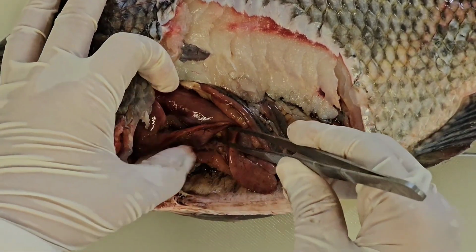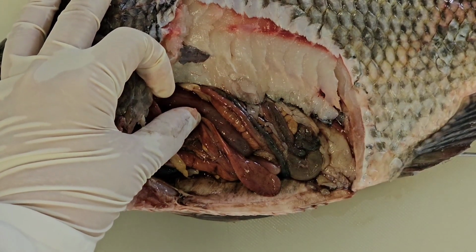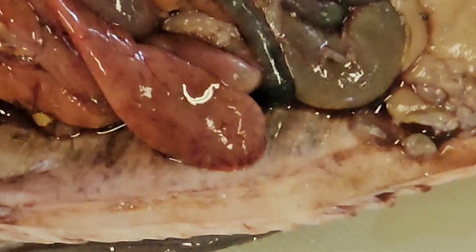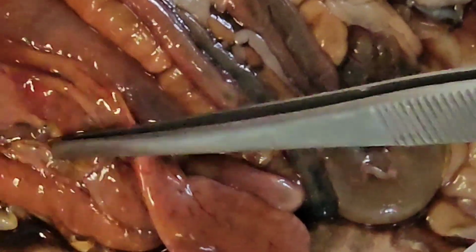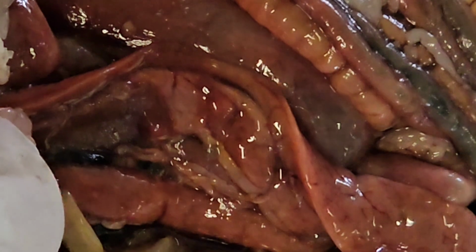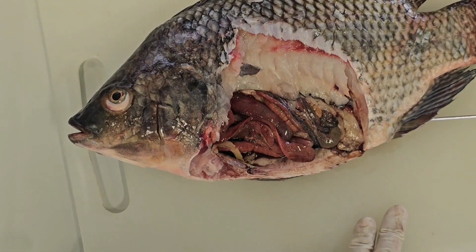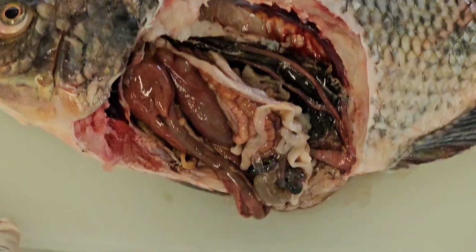And if you look underneath the liver and zoom in more, you can see the structure of the organ that helps to release enzymes. It looks like a line similar to fat, but it is located inside. So this one is called the pyloric caeca. Then I will try to cut it more so you can see the structure inside easily.